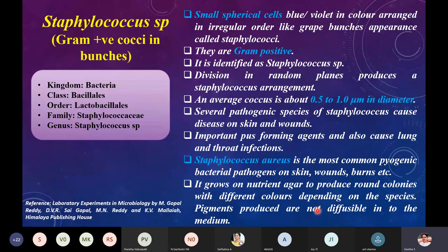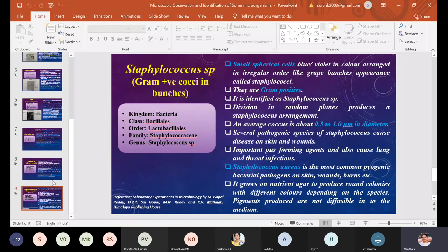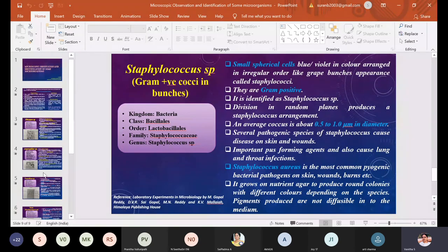These are the fungal, algal, and bacterial cultures — how to perform the staining and how to identify them using the characteristic features listed. This is the reference book used to prepare the slides. Thank you, students; we will now continue with the demonstration of these organisms.